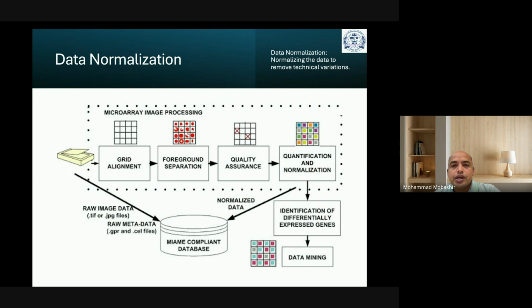Go for image processing. Well, it looks like this, but when you are using some software packages, for example, in MATLAB, then you need to download the raw data files. It could be in different formats, for example, .CEL format.